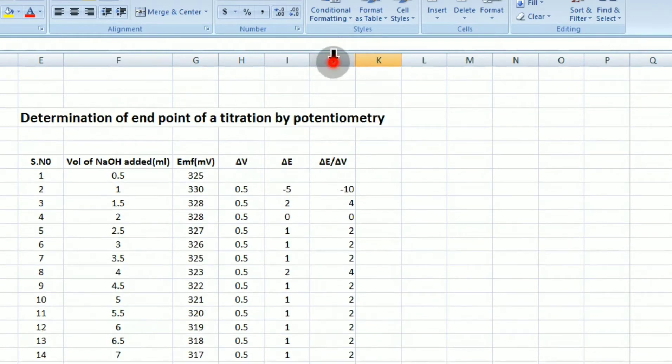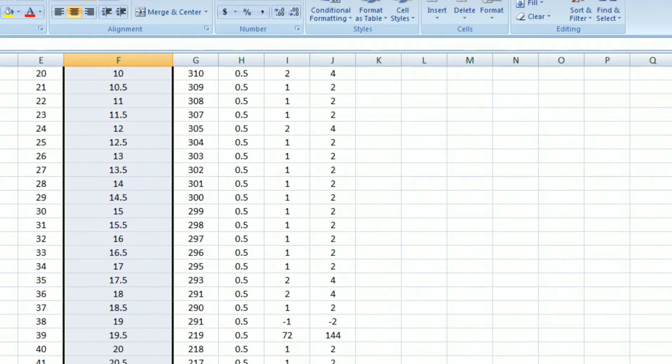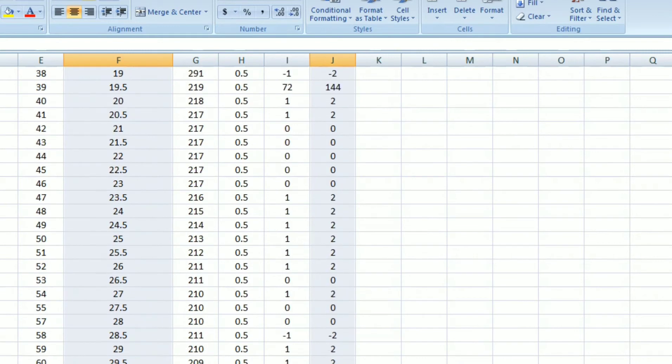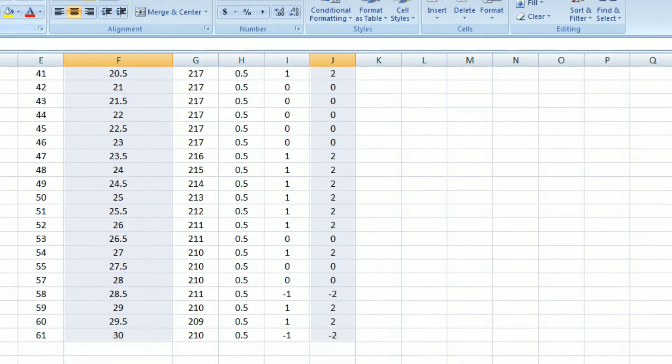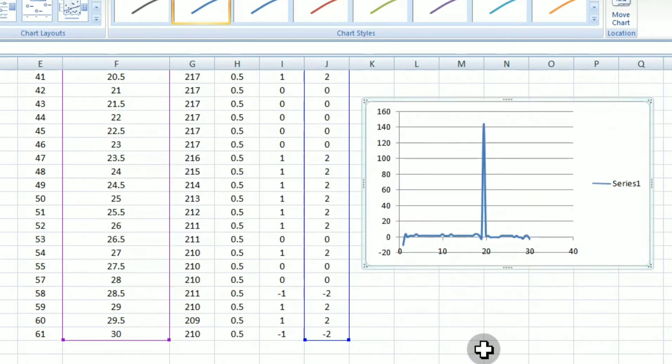And now you have to select the required factors like volume of sodium hydroxide and delta E by delta V values. So now you can see I have selected two columns and then you have to insert graph, that is the scatter with the smooth lines. Then you will be seeing this type of a graph.